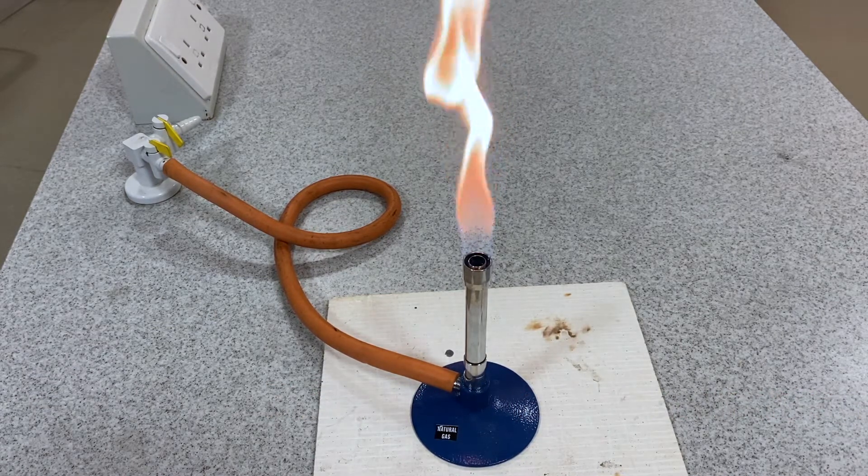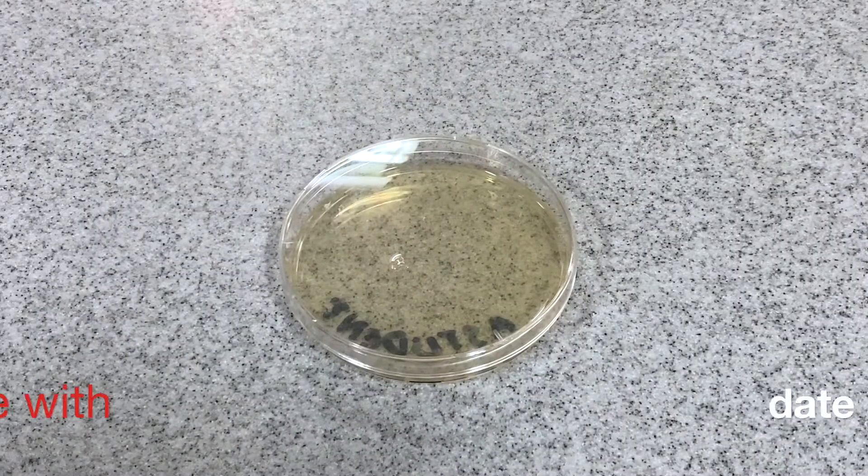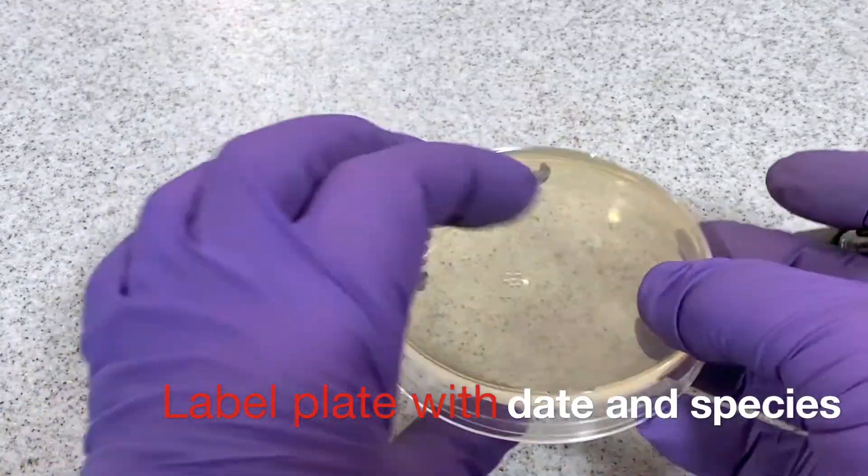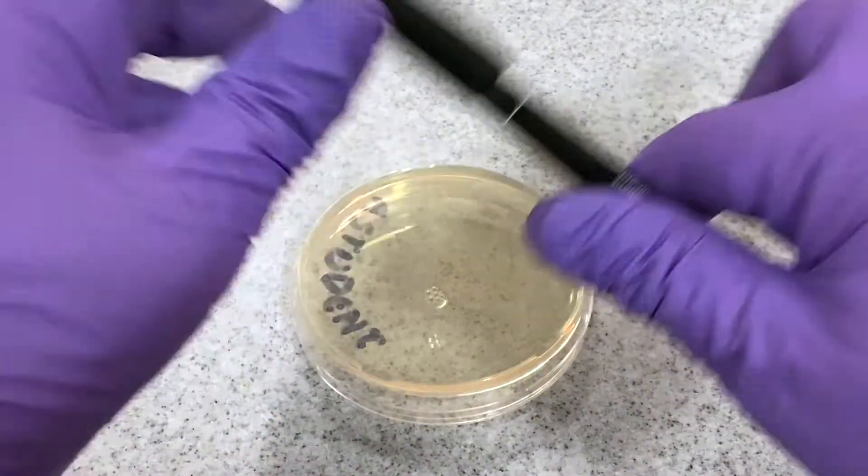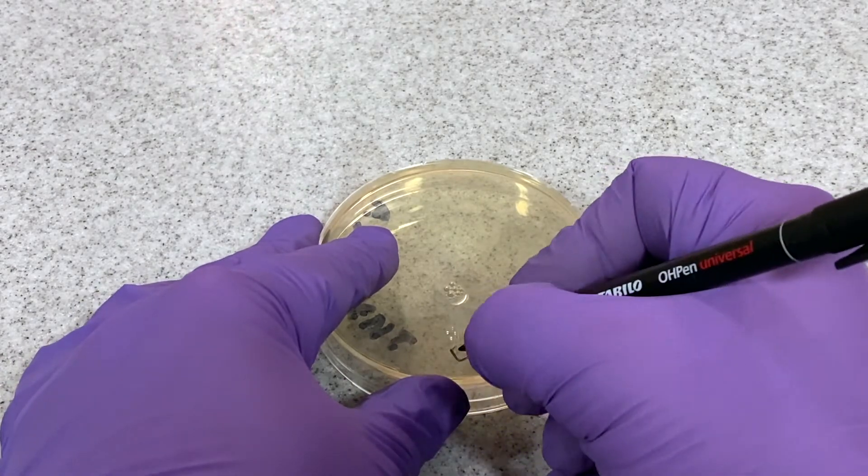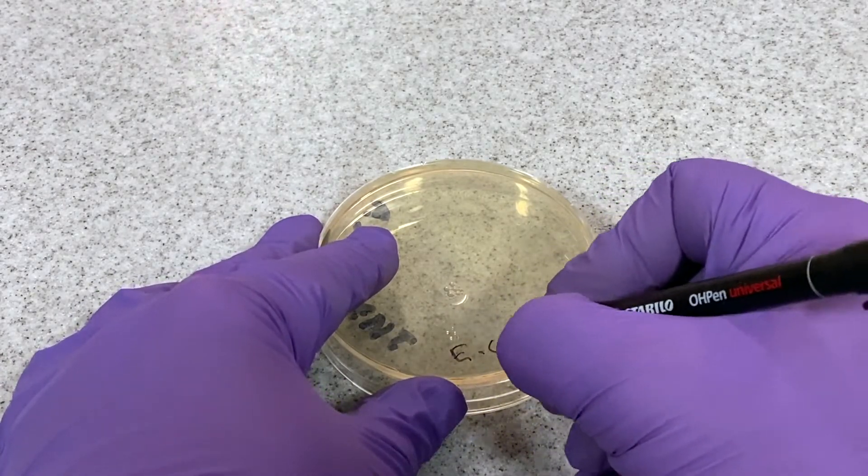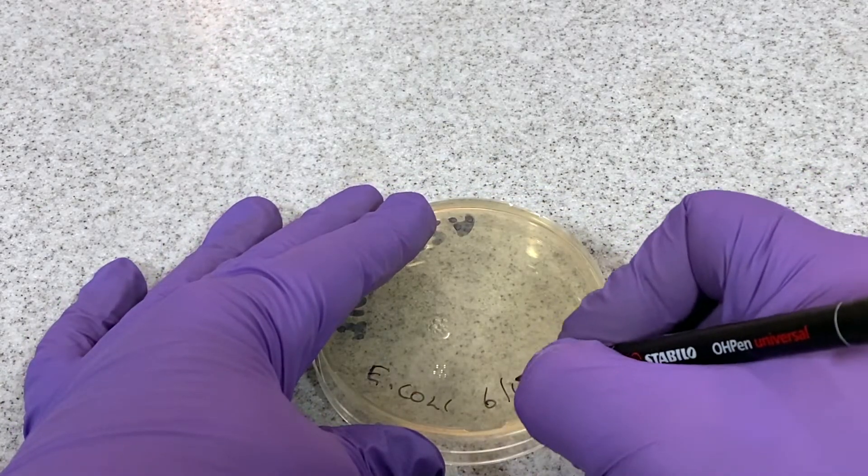During this activity, leave the Bunsen burner alight on a luminous flame. This will prevent any settling of contaminants. Before introducing the bacteria sample to the agar medium, label the plate with the date and the type of bacteria used in the culture.